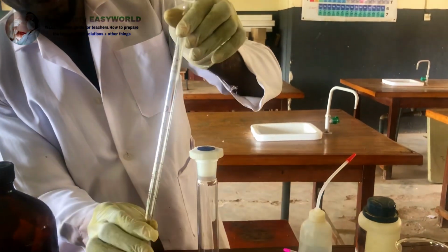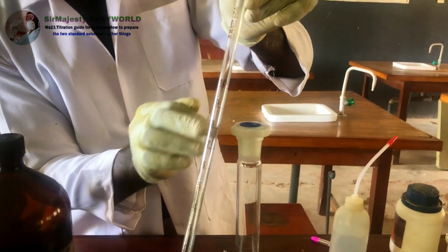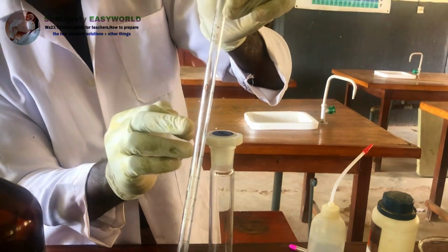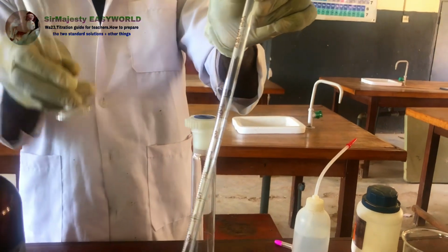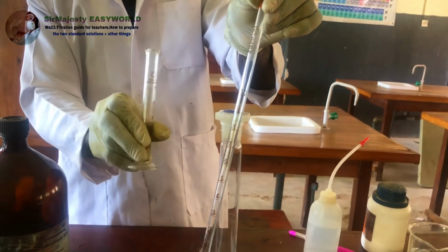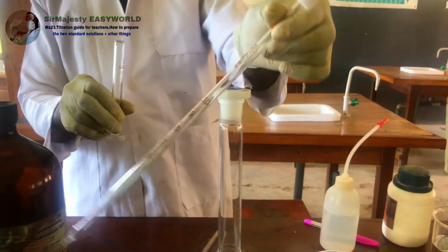The advantage of using this type as a chemistry teacher is that you see the marks are simple. You can get 0.5 easily. You see, this is 8, and 8.5 is very clear. Unlike here, where the marks are congested. They are very close. So getting the 8.5 will be more difficult here, but using this type, it's very easy.